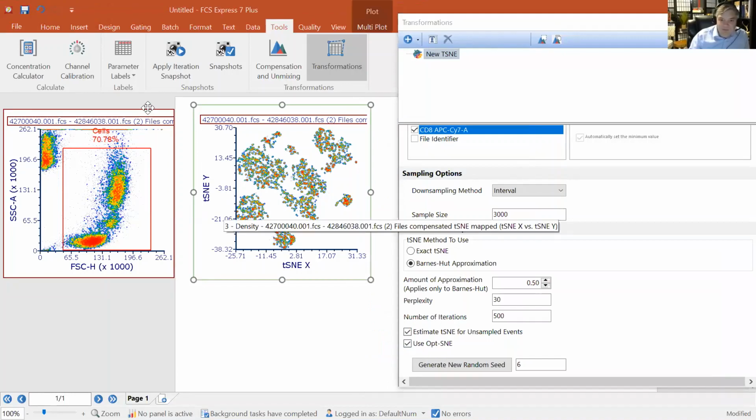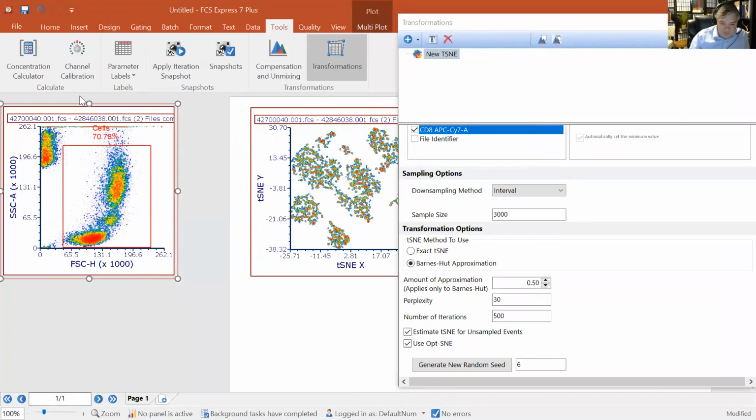Sean, just to interrupt you very quickly, we have 2 questions that came through, and I think now will be a good time before we move forward. So one question was about merging of the FCS files, and they asked if you could merge non-FCS files, such as MQD files that might be from another instrument. That was the first one.